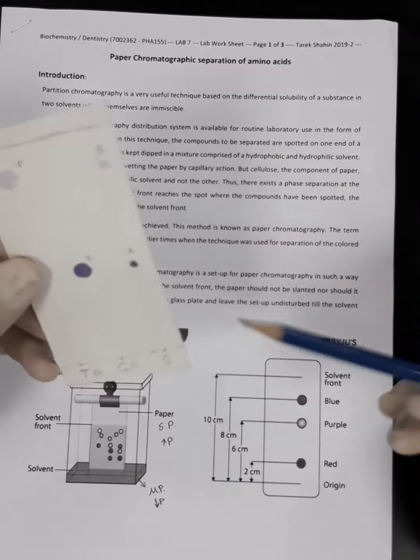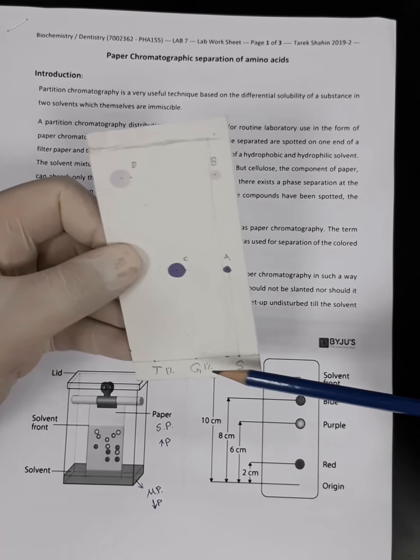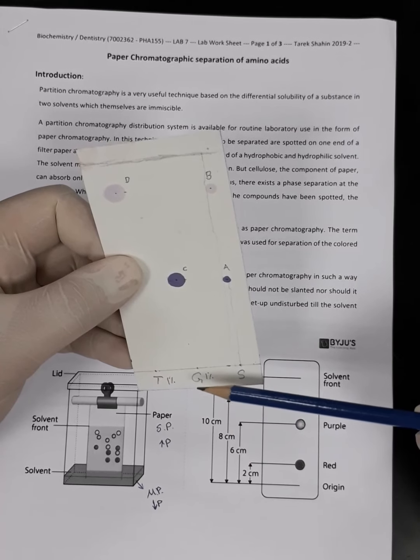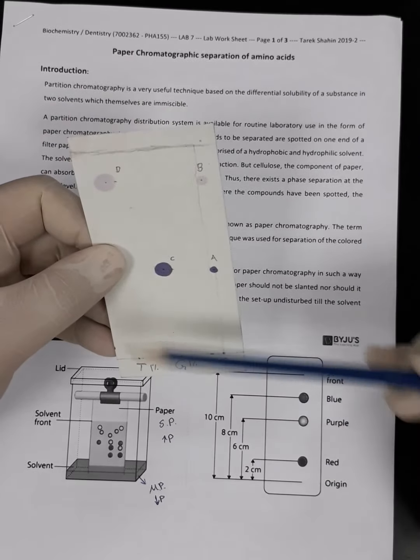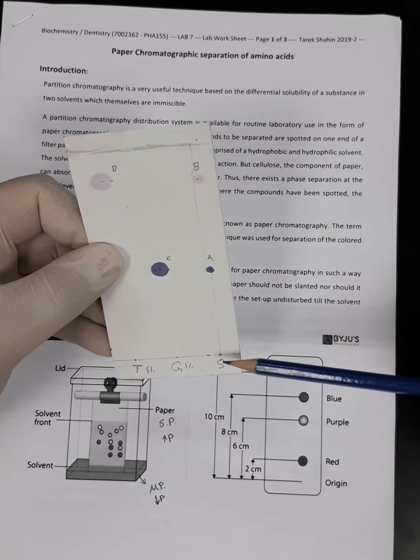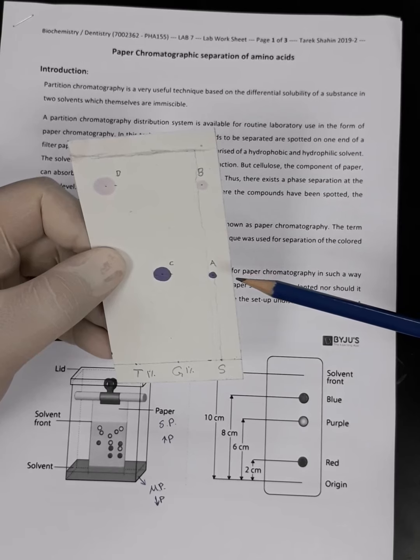Now let's summarize. We had one unknown sample, which we wanted to know if it contains glycine or tyrosine or any of them. Through the chromatographic analysis procedure, we got a result indicating that the sample contained glycine and tyrosine at the same time.